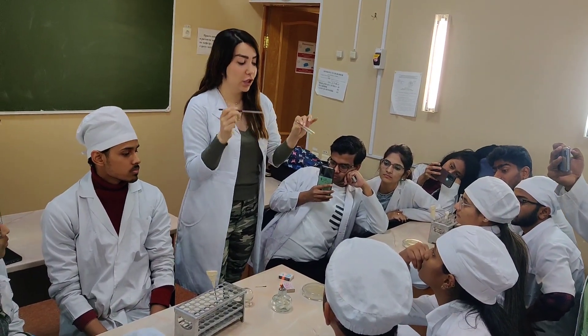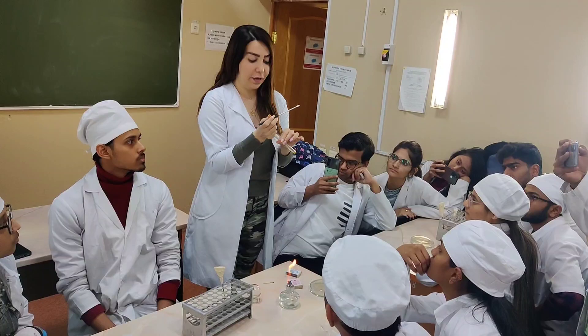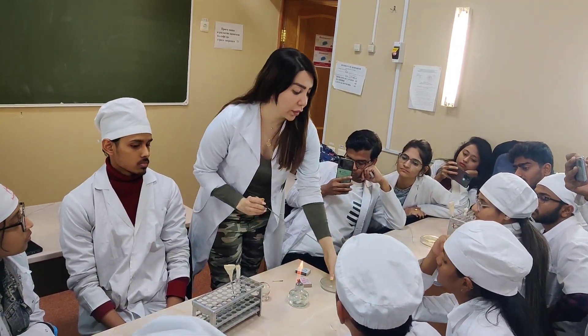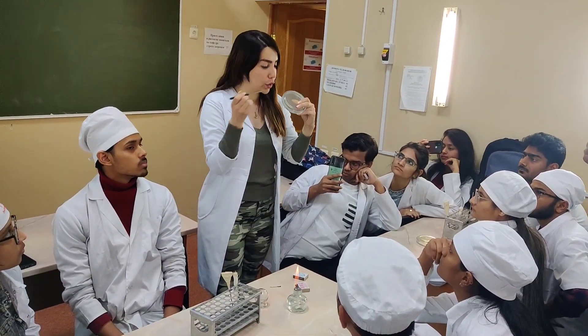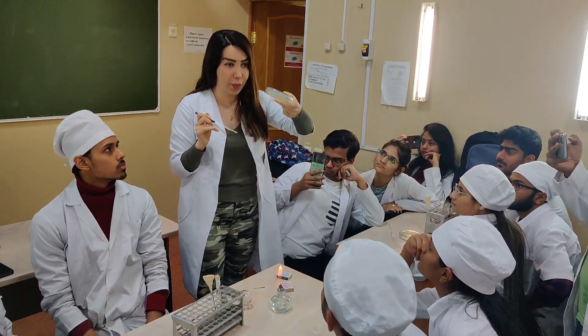If you feel it is not good, you can do it again, like a second time. And after that, put the center — I'll just show you. Some students just put the center of the glass. No, put the center of the culture media. Open that.